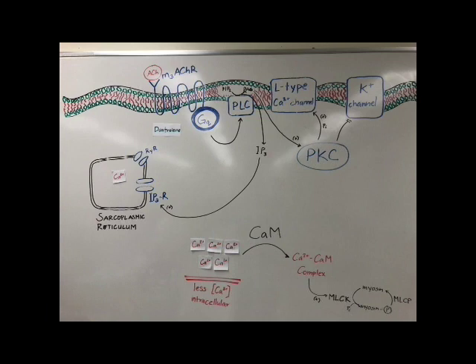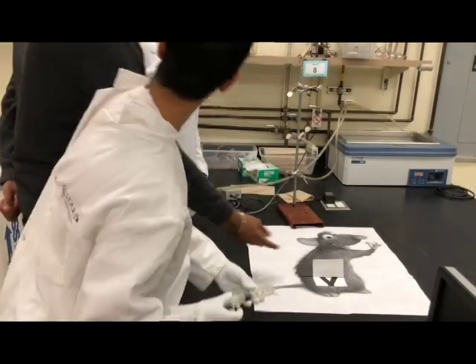Anyway, calcium binds to calmodulin to form the calcium-calmodulin complex, which in turn activates MLCK. Overall, the relatively weaker activation of MLCK gives rise to lower contractility, which is directly derived from lower calcium concentration inside the cell. That's why I think if we administer this drug, we should be able to expect to see a decrease in uterine smooth muscle contraction activity. Go ahead and administer the drugs, doctor.